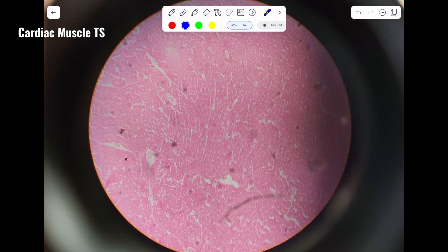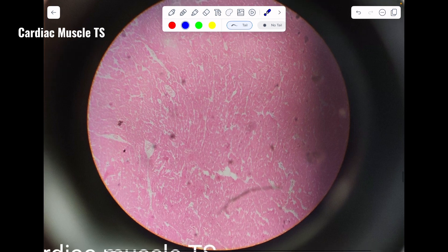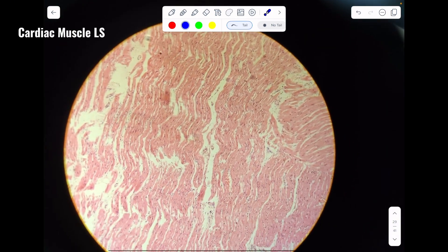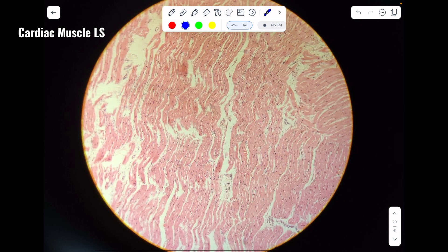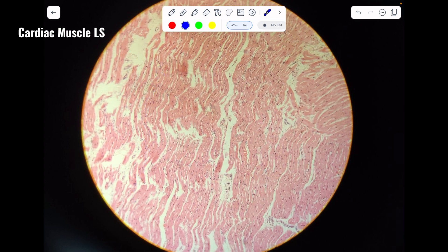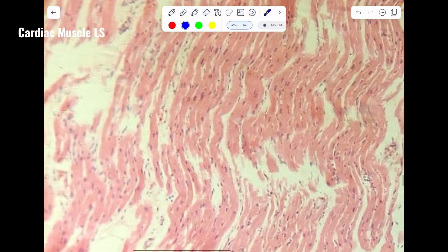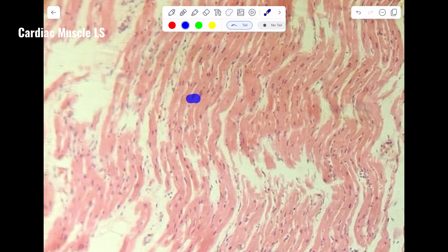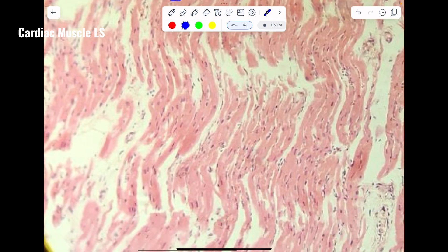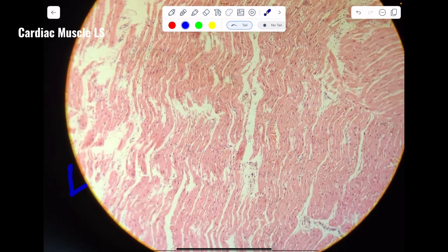So this right here is the transverse section of cardiac muscle. Here you can see cylindrical muscle fibers, and in between the cylindrical muscle fibers there is presence of branching. So this is obviously the longitudinal section of cardiac muscle.